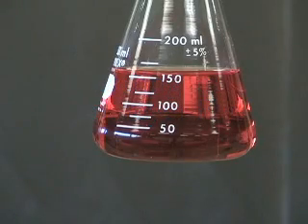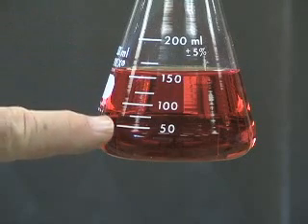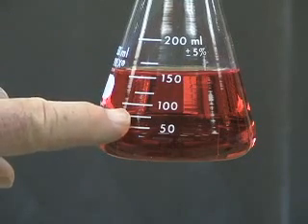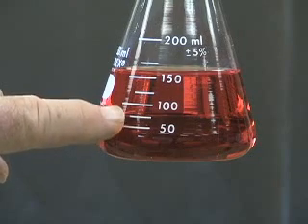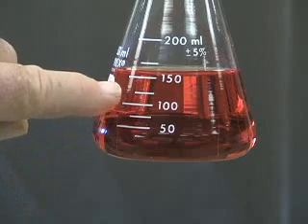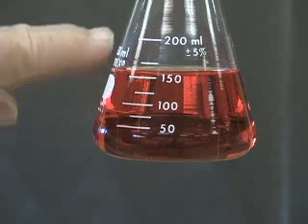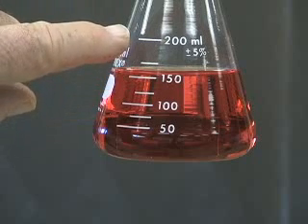Now we're looking at some food-colored water in a 250 milliliter Erlenmeyer flask. This is a very common piece of chemistry glassware. You'll notice that the markings on the side are 50, 75 — we can figure that out by looking at the 50 and the 100 — and then there's a mark at 125, 150, 175, and 200.